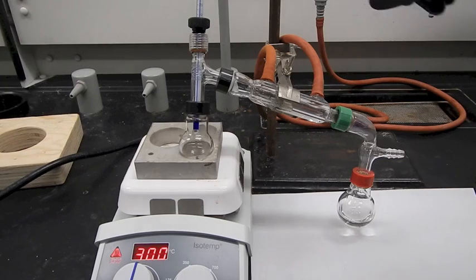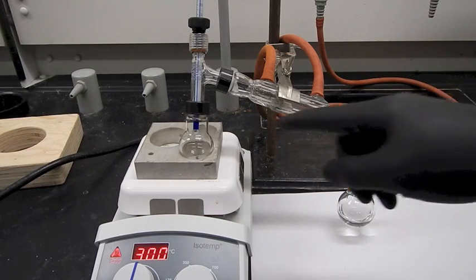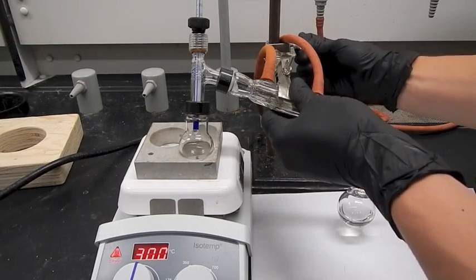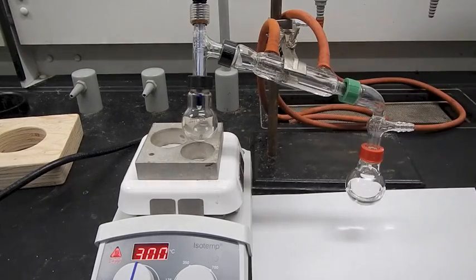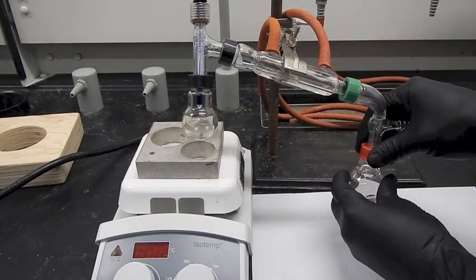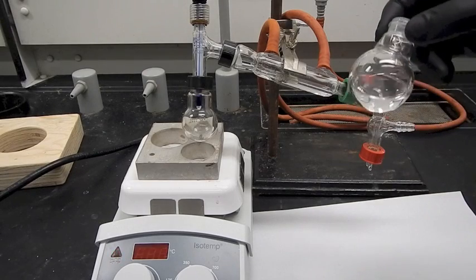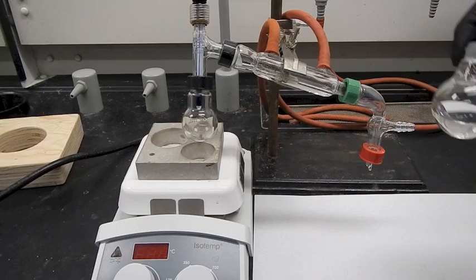It's been a few more minutes and my temperature has gone up to about 85 during the course of this distillation. My flask is now essentially empty, so I'm going to go ahead and cut off the distillation by lifting this up off the hot plate, let it cool for a little bit. The last step is just going to be to get a yield for how much pure t-Pentyl chloride you've made, and that'll be it for today.